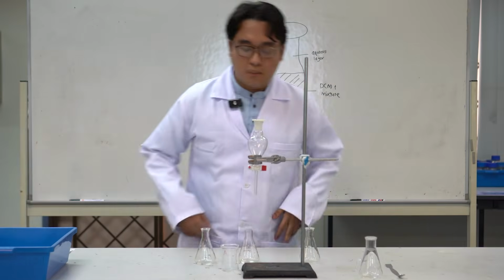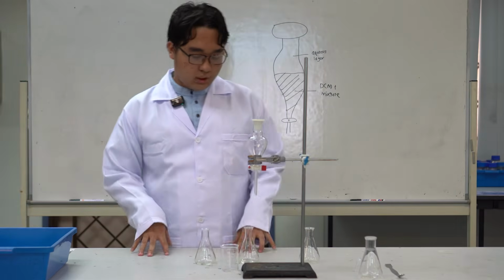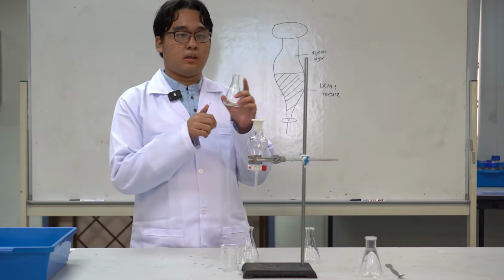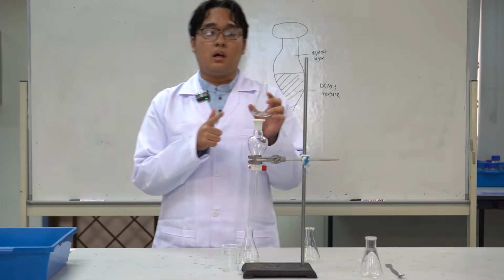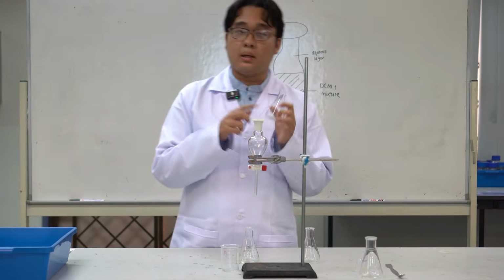Okay, thank you, Brother Azim. So now, what Brother Azim did just now is basically isolate the acid part, which we are left with. Imagine this is the mixture flask. We have two compounds, which is we are left with the base compound and also the neutral compound. So what I'm going to do is isolate the base compound.